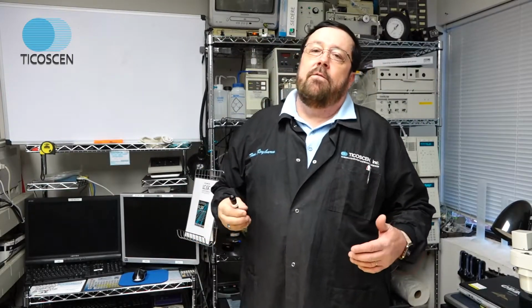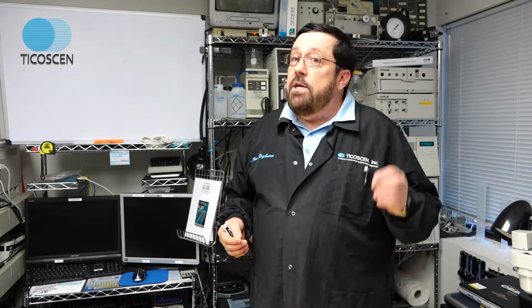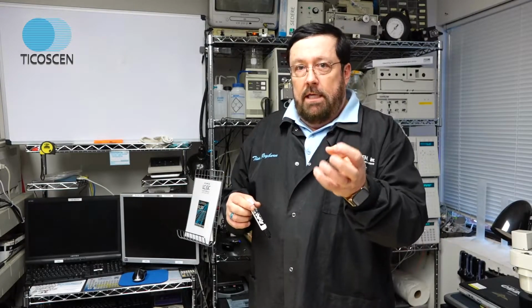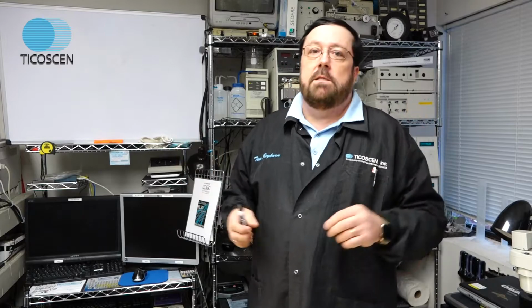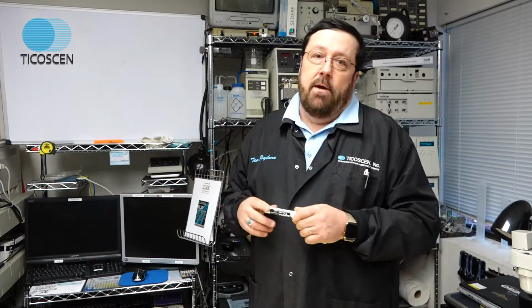Some clients I have protocols where they change their water every 3 days. That's their religious protocol. Some clients I have change the water every 24 hours. However, on the other end of the spectrum, I've had some research and development facilities where their water was a year old. And literally, there's white algae floating in the water, and that's being pumped through the HPLC system into their column, creating turbidity and random spikes and ghost peaks, as people call them, but it's really spikes of these protein structures coming through and causing turbidity and spiking.